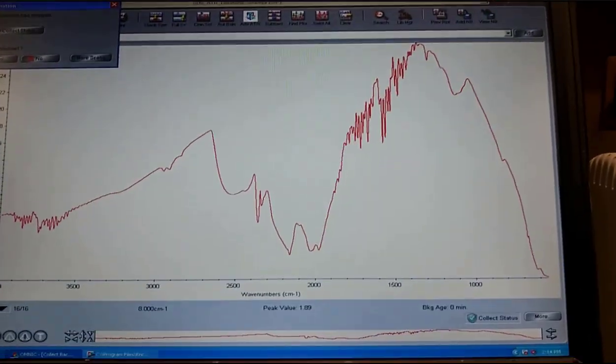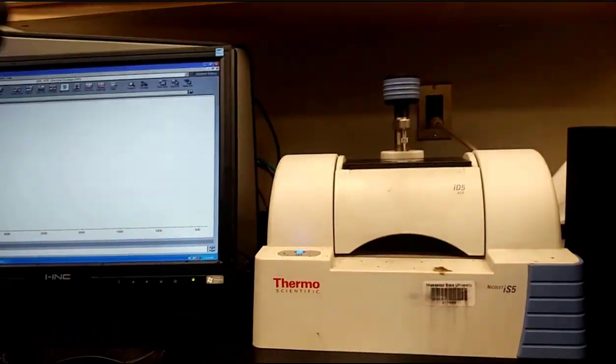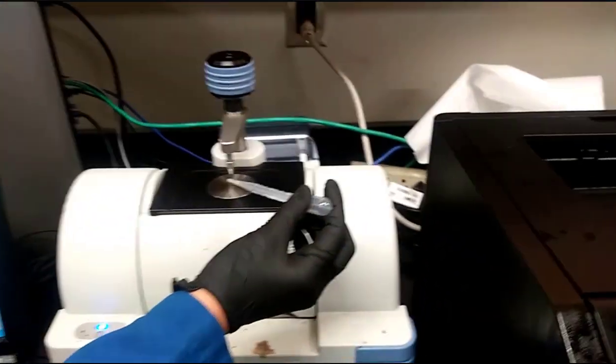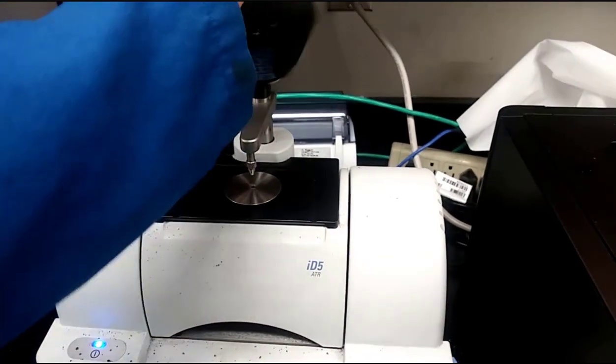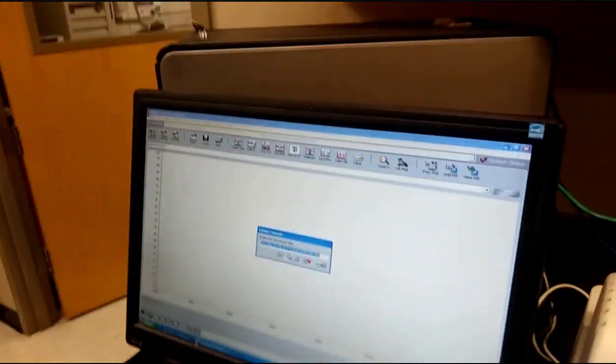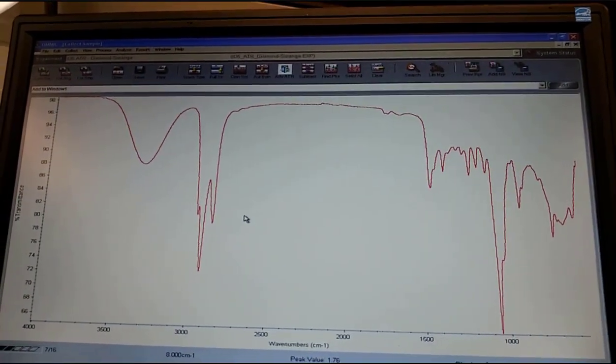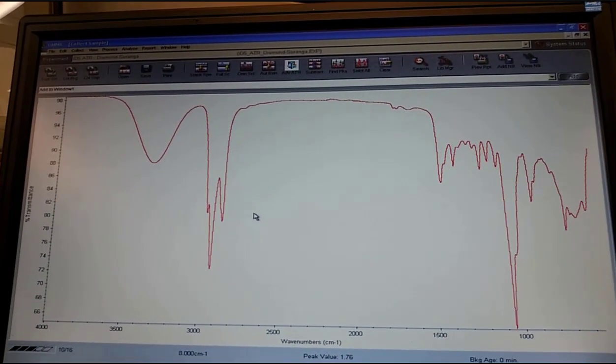All they had was nothing in it, and they took the spectra. Now they're going to add the alcohol right there. They're going to close the needle on top of it so it doesn't evaporate, and acquire the IR spectra. The big thing here is if you're seeing an alcohol, you should see a broad band. Oh, there it is, a broad band somewhere around 3300.